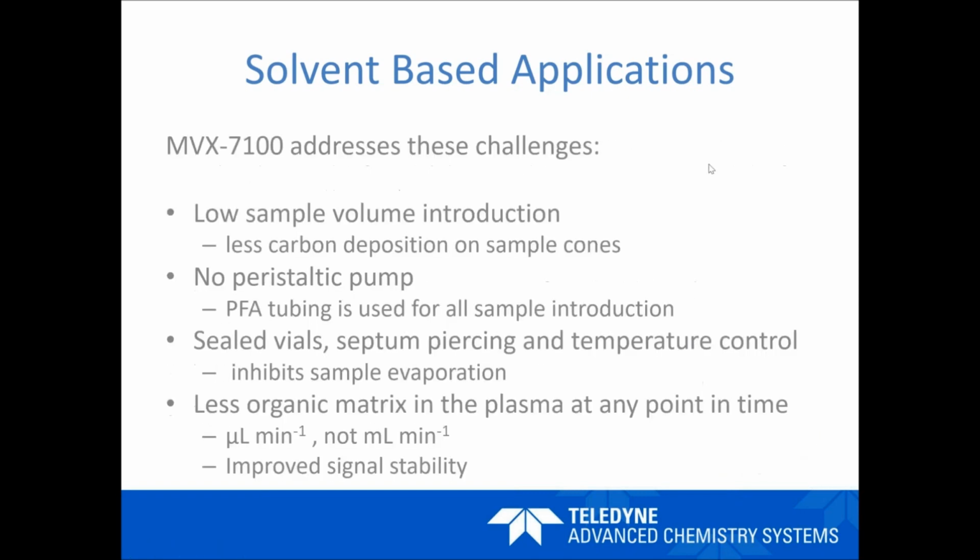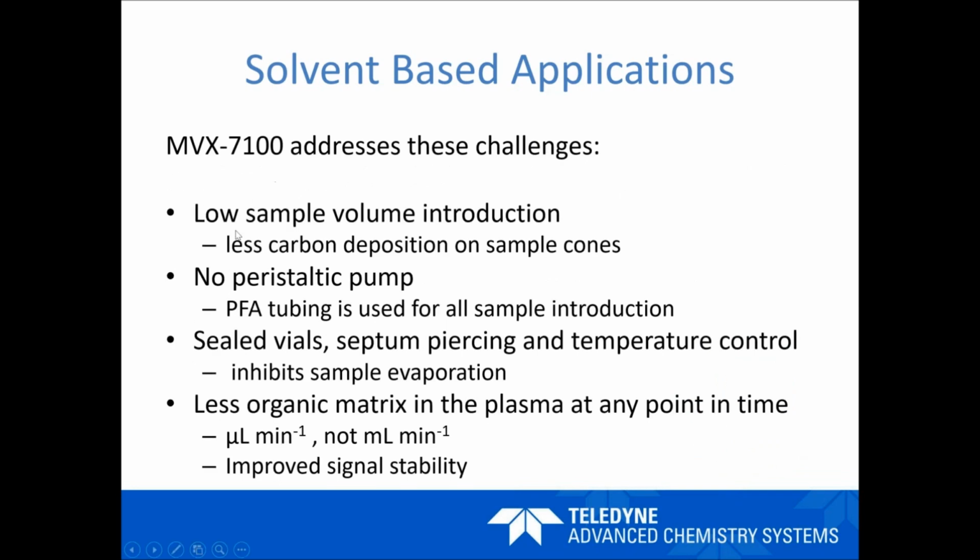Right, so essentially a summary of what I've just said. Working with low volume, less deposition on your cones, protect your pump tubing, sealed vials, keeping your sample isolated, and temperature control, very beneficial, and having less matrix going into your plasma at any one time.